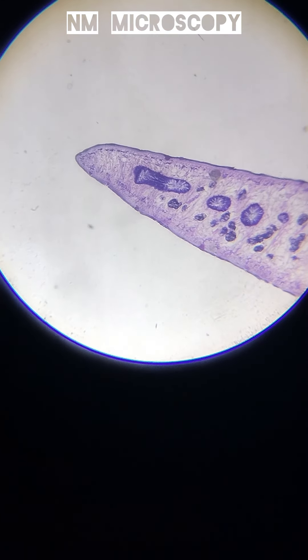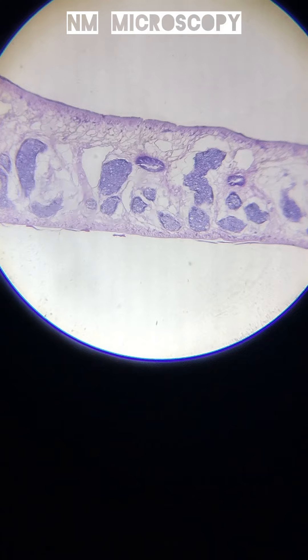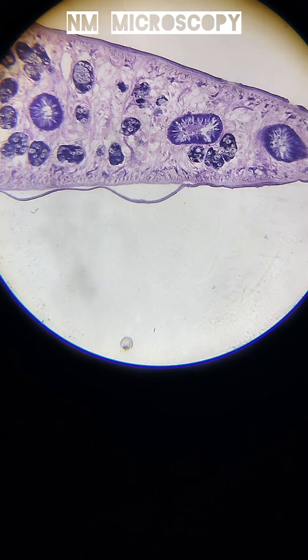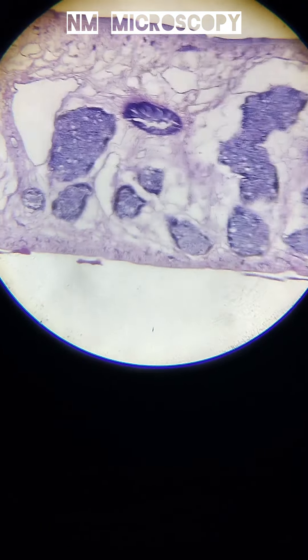Liver flukes under the microscopy. Liver flukes are flat, leaf-shaped parasitic worms. They are small, usually a few millimeters to a few centimeters long, and have two suckers that help them attach to the host. They are commonly found in the liver and bile ducts of animals and sometimes humans.